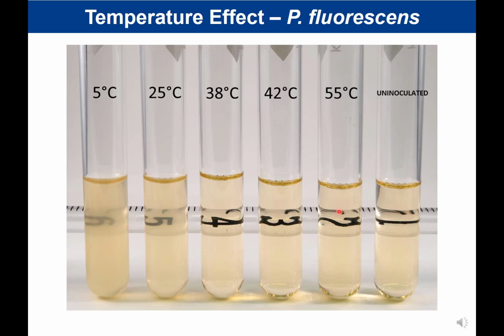So you can see the number 1 very, very well. If I look at 55, notice that 55 degrees looks roughly the same. Notice that there's no turbidity obscuring the number. If I look at 42, it looks about the same. If I look at 38, it looks about the same.